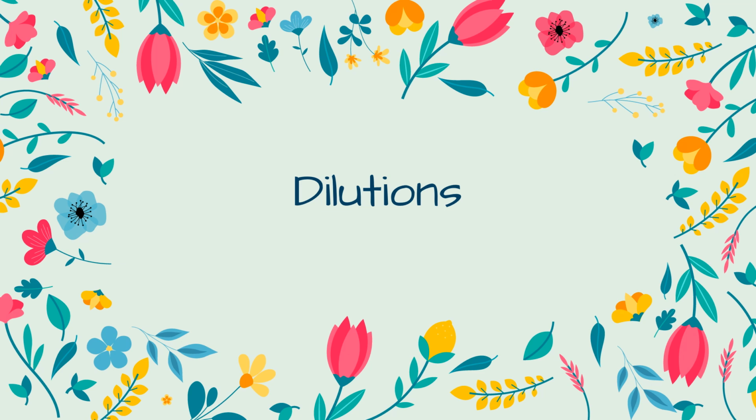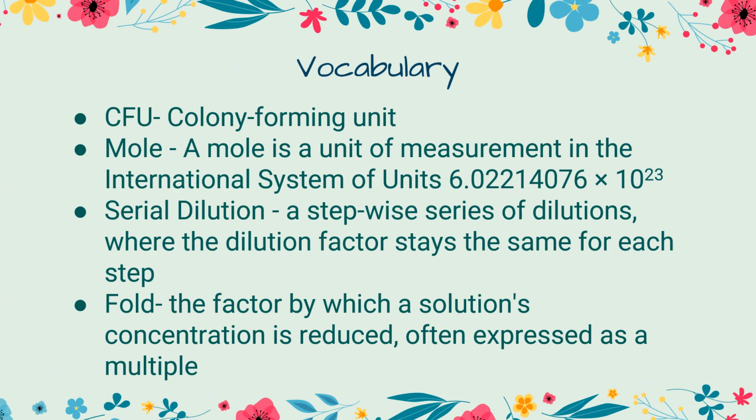All right, so today we are going to be talking about dilutions and specifically looking at dilution factors. A couple of vocabulary words that we want to go over before this lesson starts is a colony forming unit, also known as a CFU.